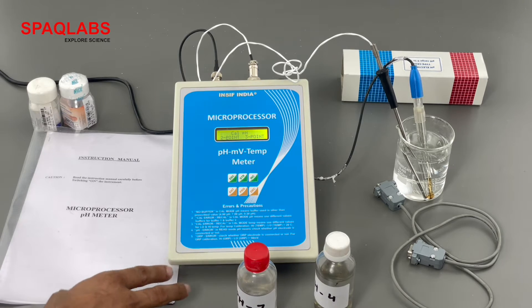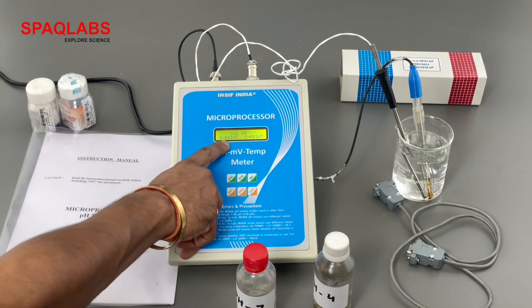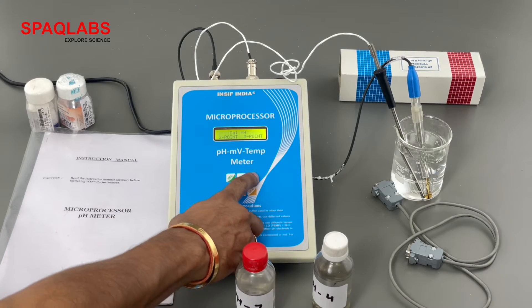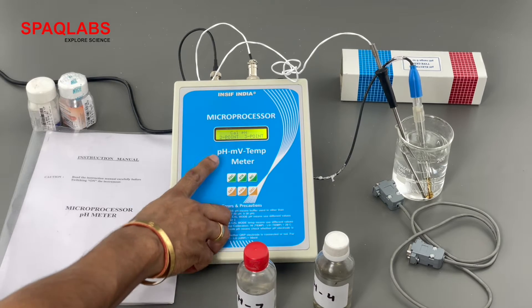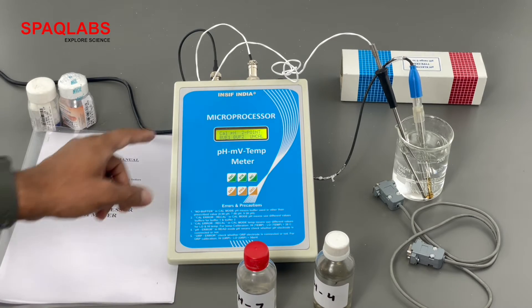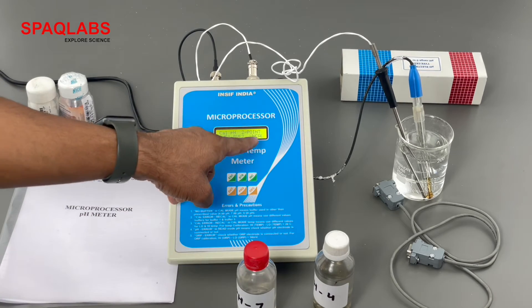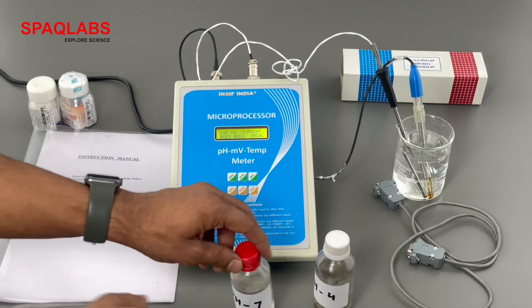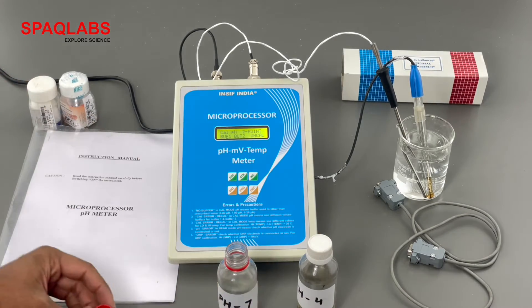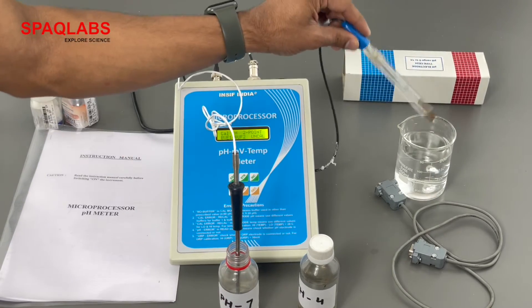This pH meter is compatible for three-point calibration also, but we are going to do two-point calibration. The cursor is below two-point; one can change from three-point to two-point using increase and decrease. Set cursor to two-point calibration and press enter. The menu now shows buffer 1, buffer 2, and uncal. Uncal is used to uncalibrate the pH meter. Since this pH meter is already calibrated, we are going to re-calibrate it, so insert the temperature probe and pH electrode into the buffer solution.